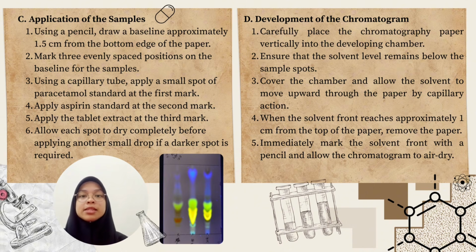Finally, the chromatogram is analyzed. After the paper has dried, the separate spots are observed and compared with the paracetamol and aspirin standards. The RF value of the spots can be calculated to identify the active ingredient present in the pharmaceutical sample.